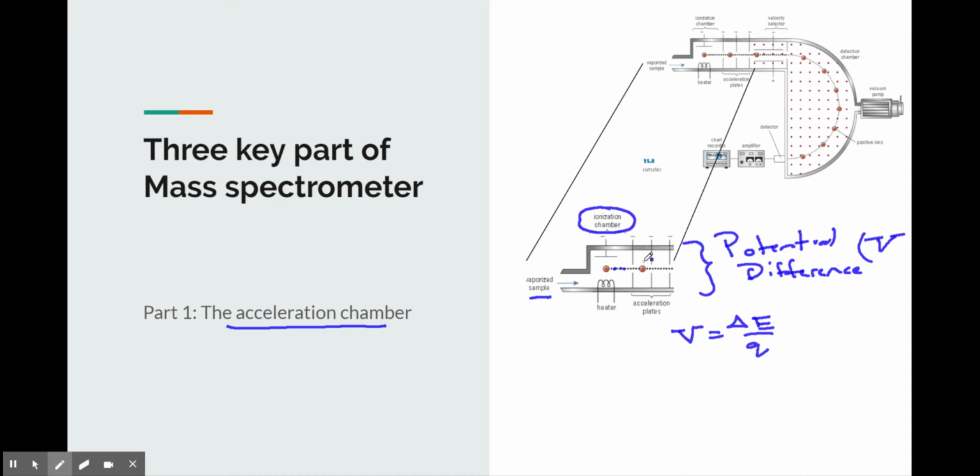So within this section, it's not really demonstrated pretty here, but I will accent the fact that we could create a region here where there's a gap in a plate, and we make this plate positive. I'll get a red pen, we'll give ourselves another plate over here, and in the simplest case, we could say, okay, over here, we have a negative plate. And clearly this positive charge here will come in with very little velocity, and by the time it comes here, it will have an increased velocity. And that's because we're changing the kinetic energy specifically.